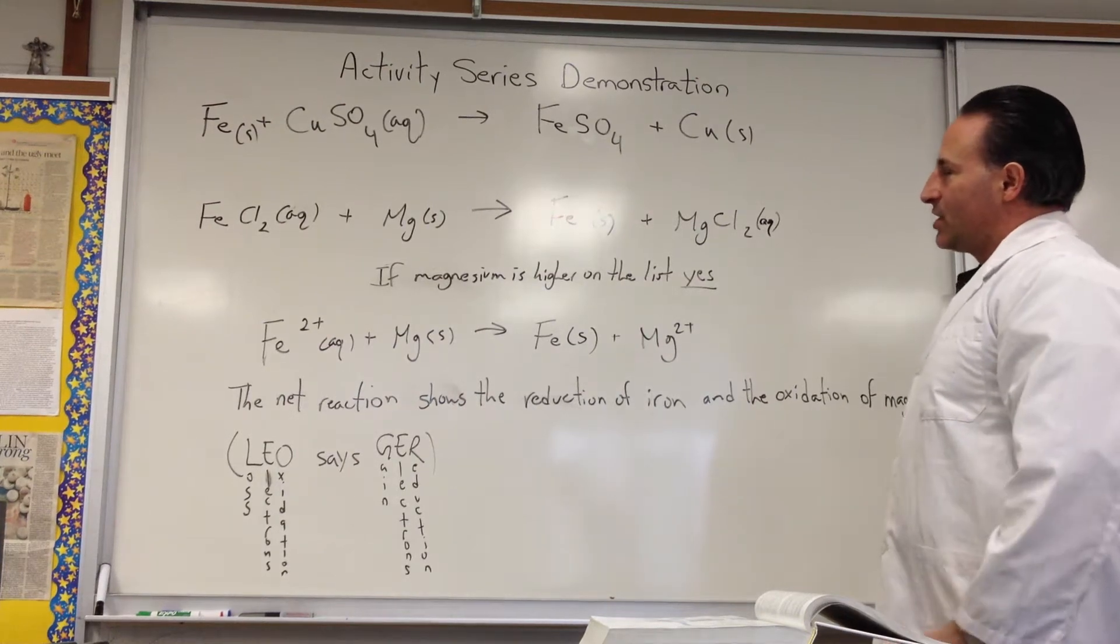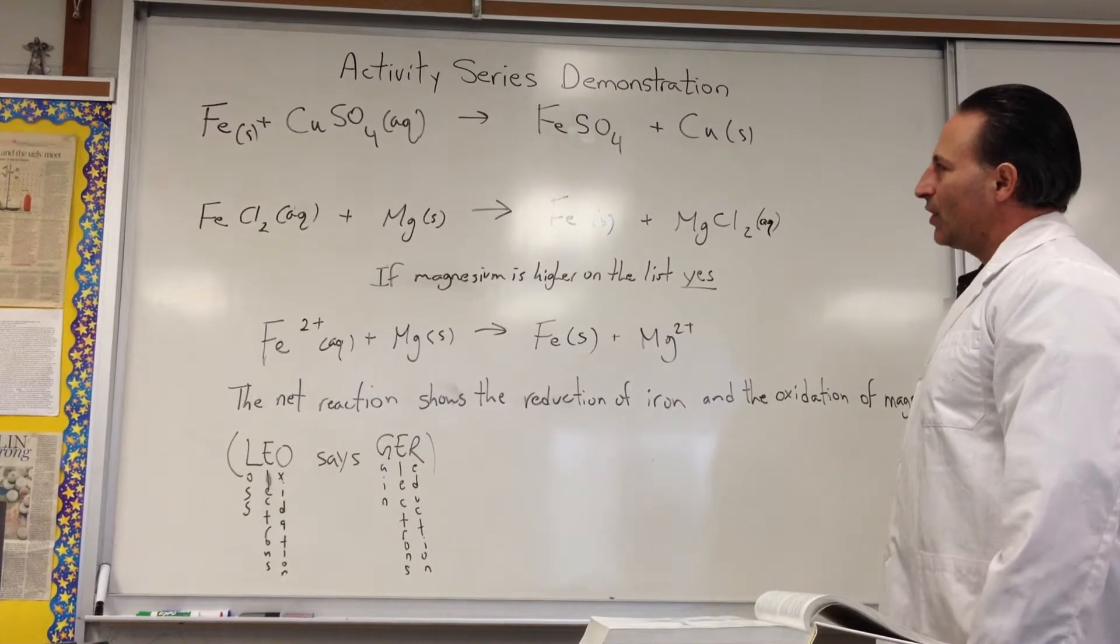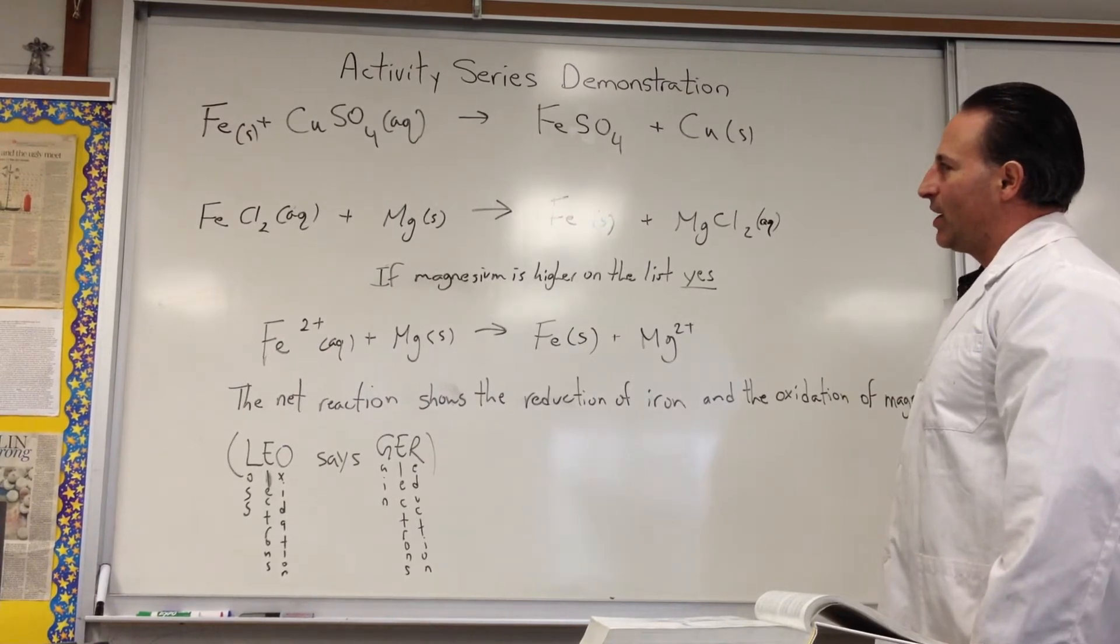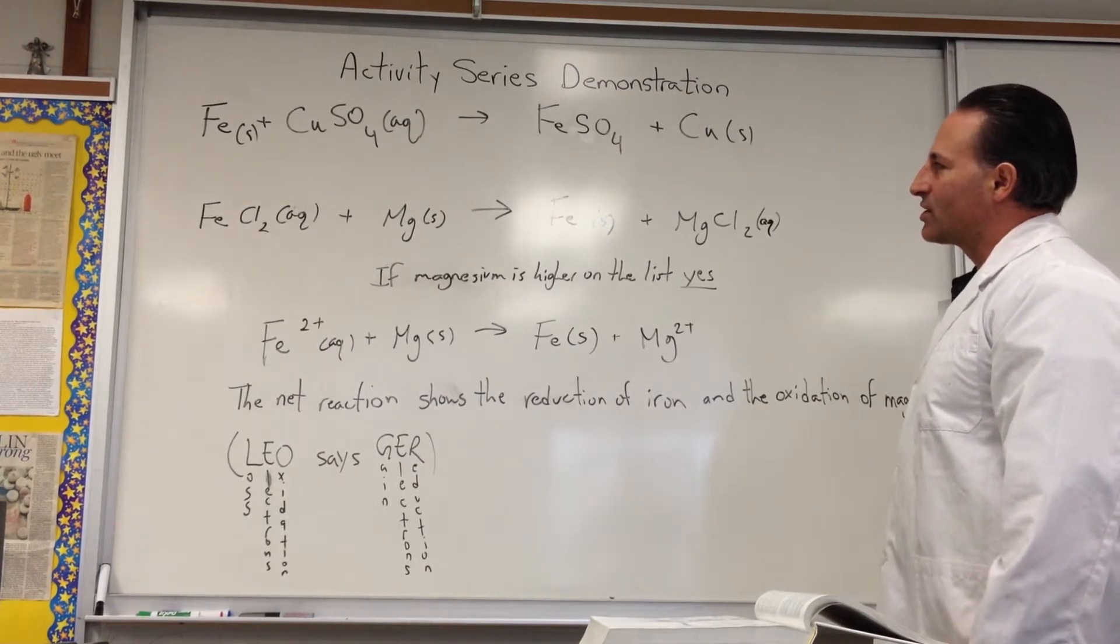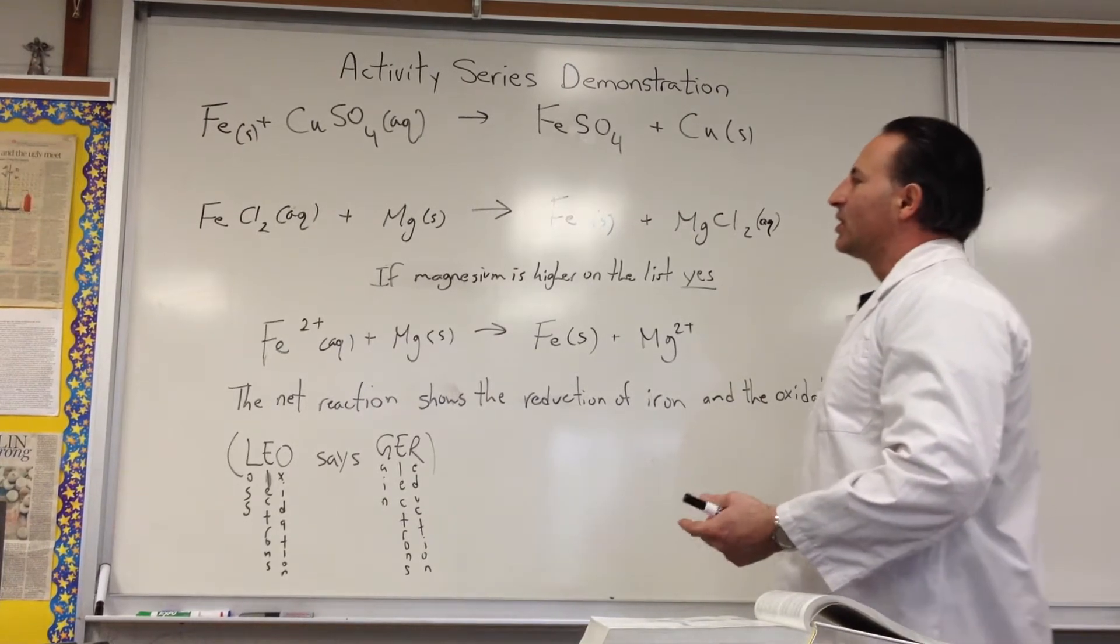This is an activity series demonstration. The activity series of metals demonstrates how metals that are more easily oxidized will force another metal to accept electrons.